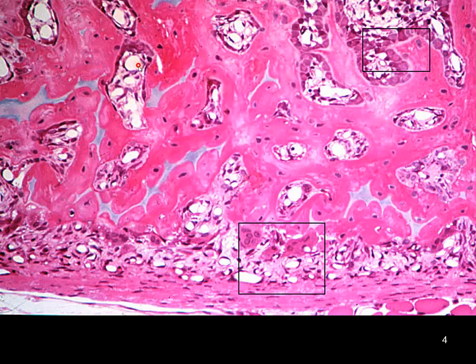Here we have cavities where we have blood vessels and other cells. The flattened cells that line these are going to be bone lining cells, and we're not going to pay a lot of attention to those. We're going to be looking at these much taller cells that we see lining these cavities, and these are our osteoblasts that are actively laying down bone matrix. Now, if you notice just beneath the osteoblast, there's always going to be a clear area. This is going to be the uncalcified organic components of the bone matrix, and we simply call that osteoid.